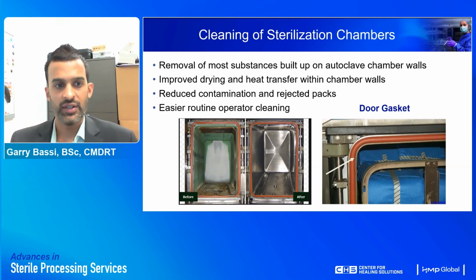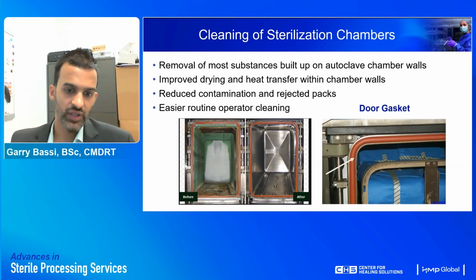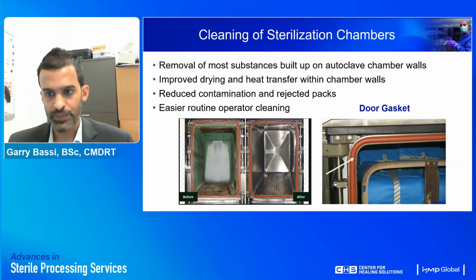And cleaning it more frequently would be an easier routine for the operator than cleaning it after an extended period of time, where there's so much staining that has built up. Also note on the picture here, you have your door gasket that needs to be checked on a constant basis, especially if the gaskets are being filled with steam, then steam could be leaking out. The gasket itself also needs to be cleaned, wiped and inspected.